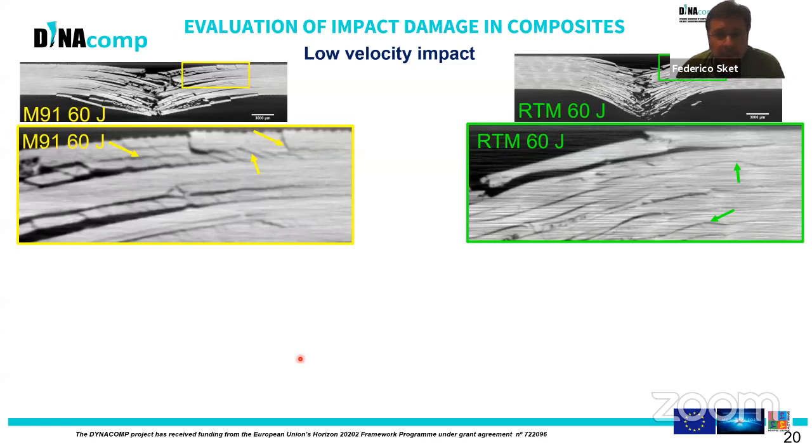But even in this case, we can zoom in into a certain part of the volume and take a look at how the damage is distributed inside the material. The rougher delamination surface that we see here, how it goes zigzagging in the unidirectional prepregs, is due to toughening particles that are in the matrix, while in the case of the woven fabric, the delaminations follow a profile defined by the ply interface. Therefore, you can see these undulations.